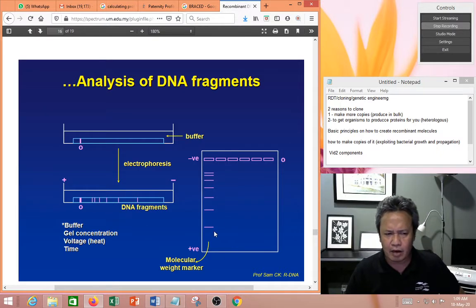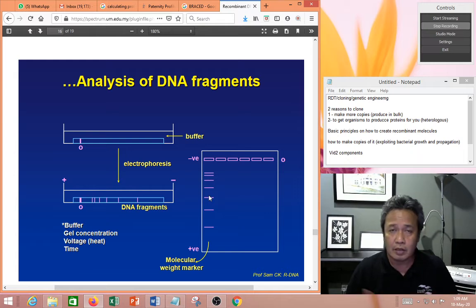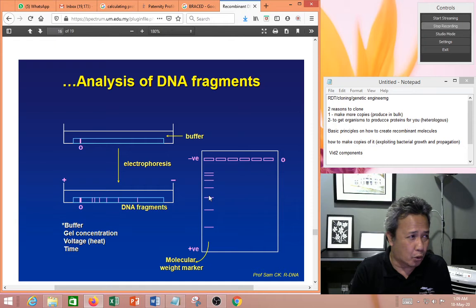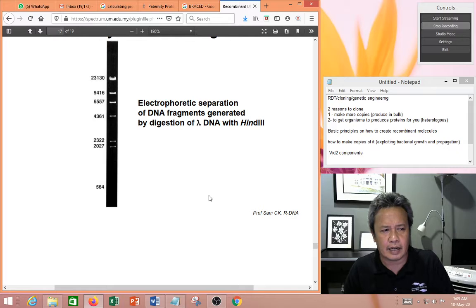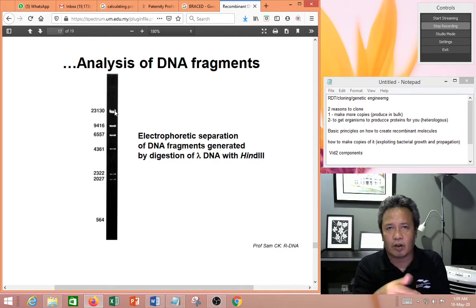All right. But how do you know what the sizes of these DNA molecules are? Normally, when you run a DNA sample, you run it alongside another sample of known sizes, and these are called the reference sizes, also called a DNA ladder, because you have many different bands for different sets of fragments. You can buy commercial ladders. This is an example, a lambda DNA that's been cut. So you know that that fragment is 2027, that one's 2322, and so on. You run this alongside your sample so you can estimate the size of the band that you're looking for.